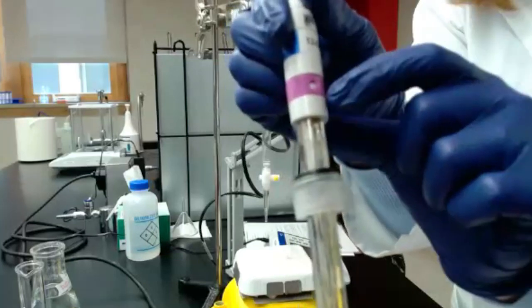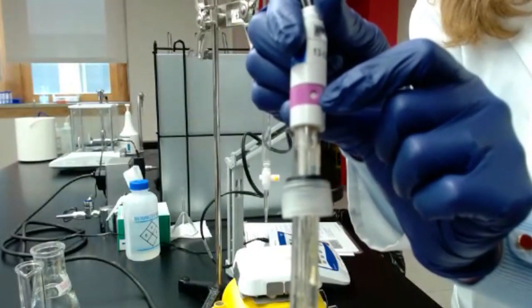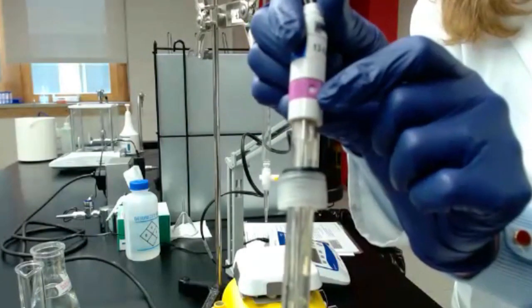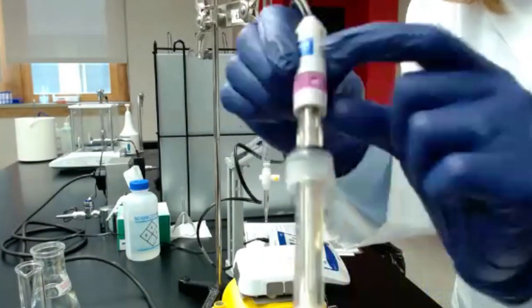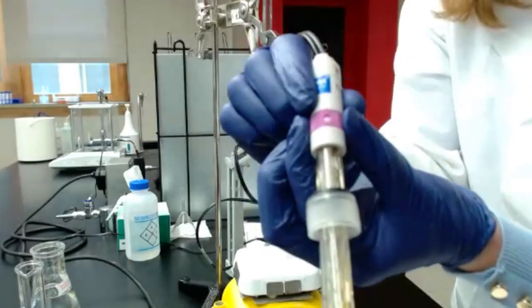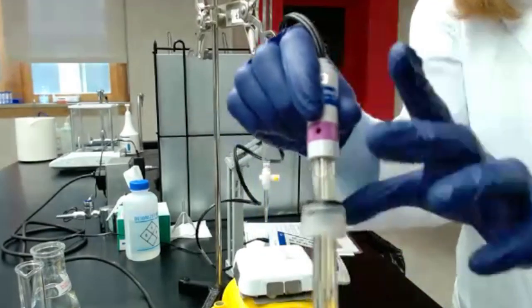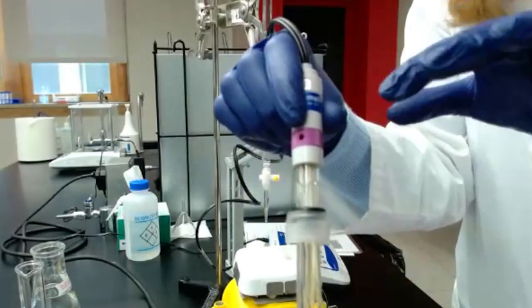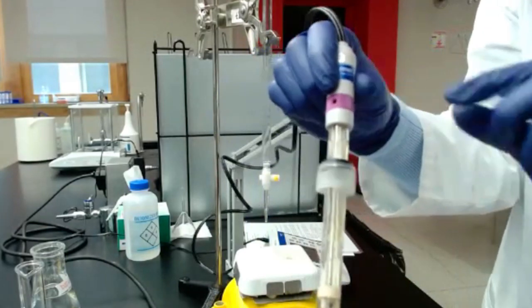Also, you might have a little hole on your electrode. If you do have a hole, make sure it's open. That's just to make sure the pressure is the same between the inside of the electrode and the outside. So make sure that's open.